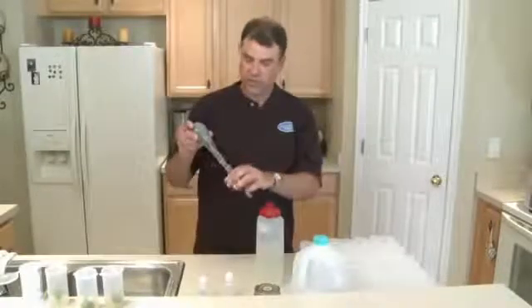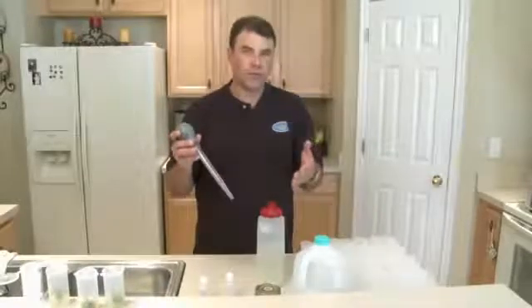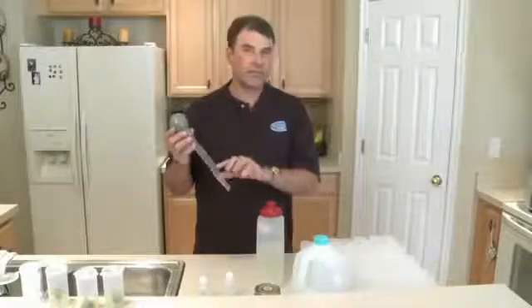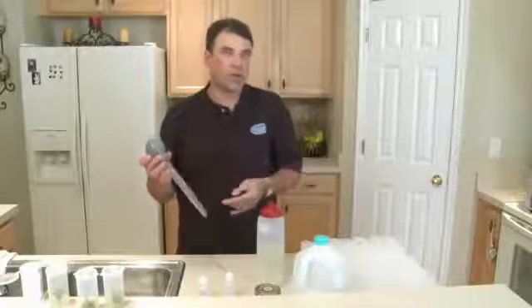We'll start with a turkey baster. If you don't own one, a couple of teaspoons will work. They usually all have markings on them. A teaspoon is five milliliters, a tablespoon is fifteen, so you want about one and a third tablespoons.